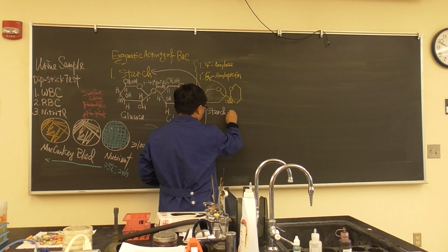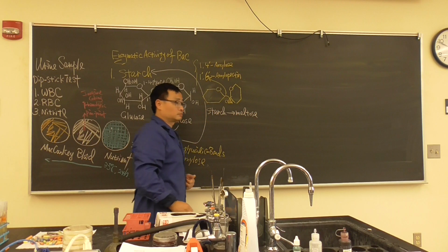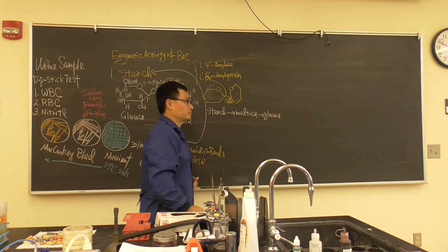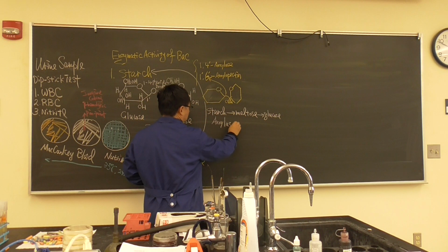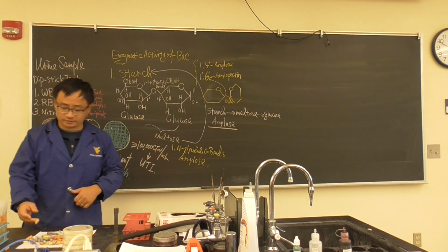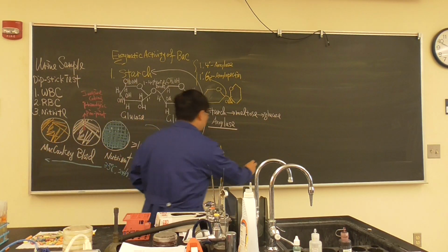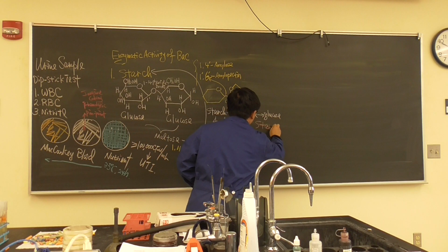Become maltose. They further break down, become glucose. Which is the enzyme name? Amylase. Okay, bacteria could have amylase. So how do we do it? How do we determine bacteria has amylase? It's very simple. We have an agar called starch agar.